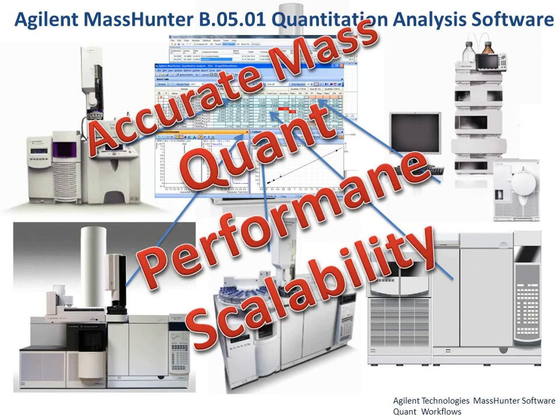So that assumption with an 8-hour shift means that 50 samples is basically more than you could do at 10 minutes elapsed time for the run. So 50 samples is considered the high end of the sample dimension. And we'll talk in a moment about the target compound dimension and move on to the findings.